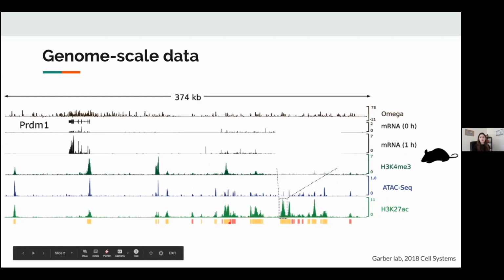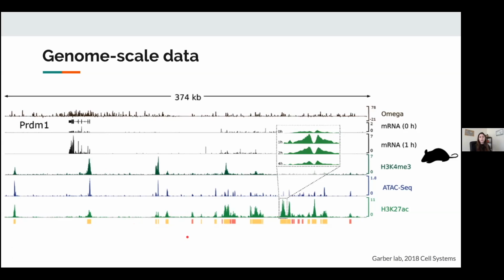We've identified them through the coverage data, and we can use it to try to understand the regulatory landscape of a given cell. So with this picture, I also wanted to point out that there is a lot of power in these studies when done in combination. So integrating all of this information can help us understand more than we would if we examined them separately. And to introduce one final dimension, we can also perform these studies through a time course. So you can follow cellular processes as they happen if you collect multiple time points.